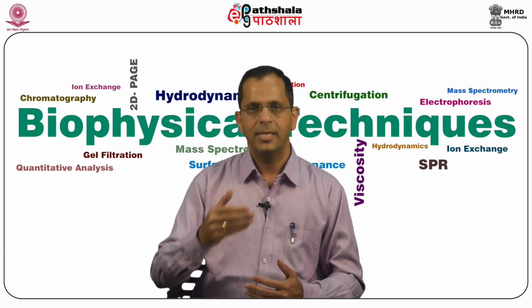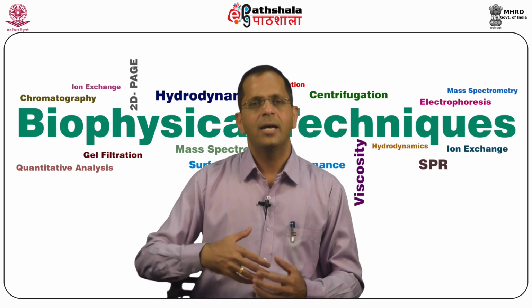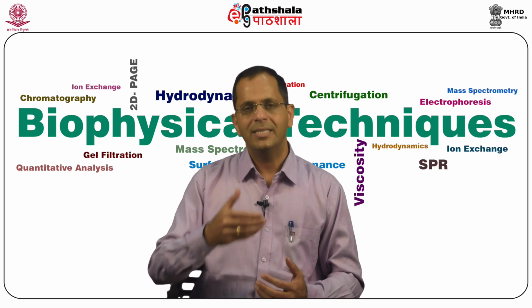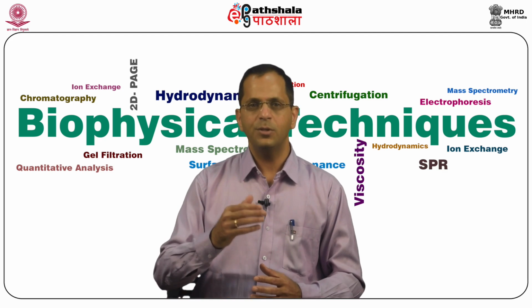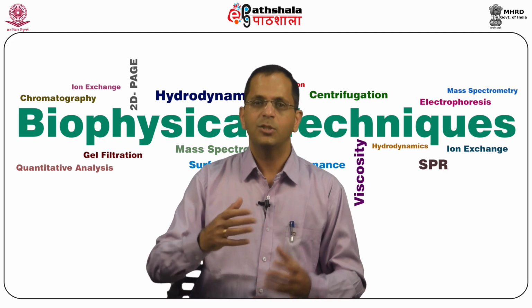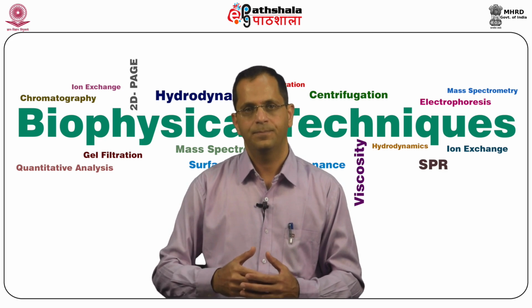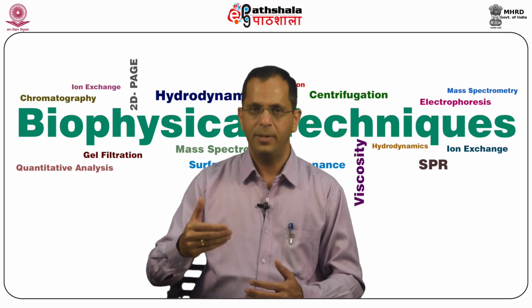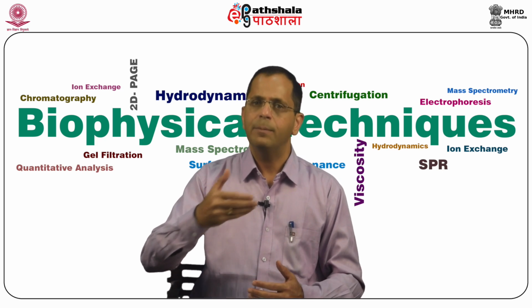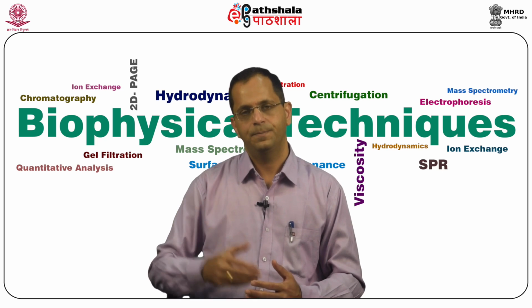Another important thing is to remove substances such as salt, DNA, RNA, carbohydrate, and other possible ionic molecules that interfere with the process of electrophoresis. You also need to keep the proteins in a solubilized state during the entire period of electrophoresis. You need to maximize the proteins of interest in the sample and at the same time minimize the high abundant protein fraction in the sample.